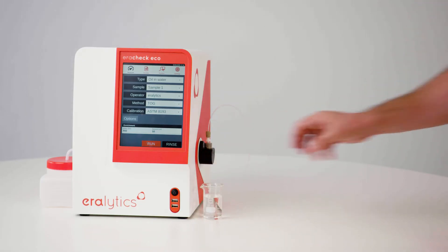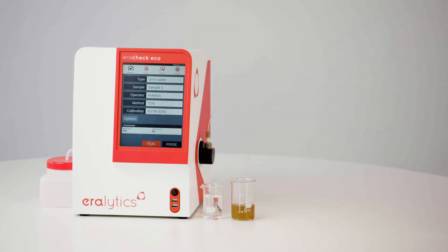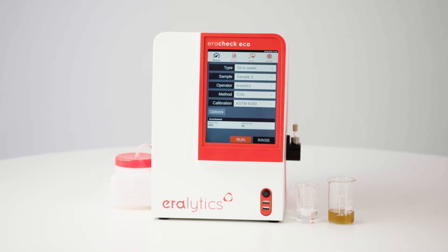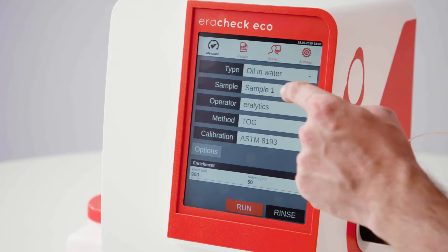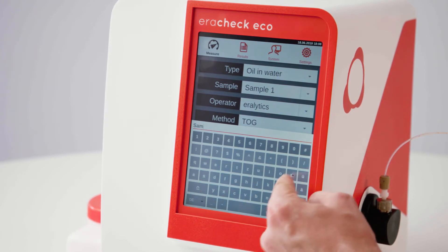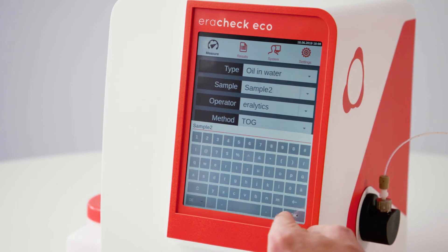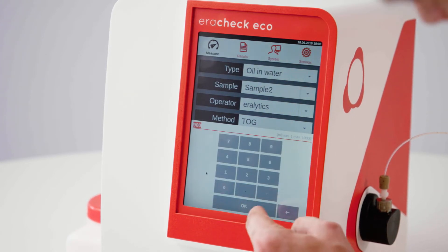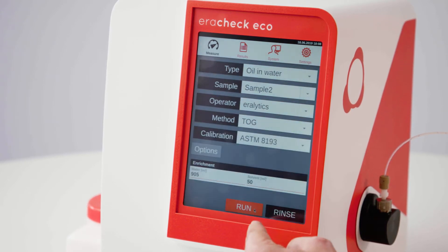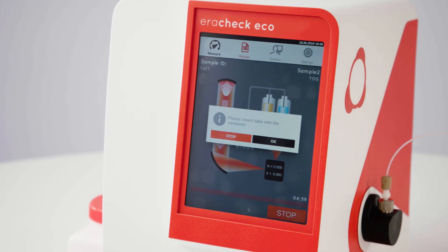Now the extracted sample is ready for automatic analysis by Arachek. The intuitive user interface guides you through the measurement. Enter a sample ID, operator, and enrichment factor. If required, adjust the method or select a user-generated calibration. Press Run to start the fully automated measurement.